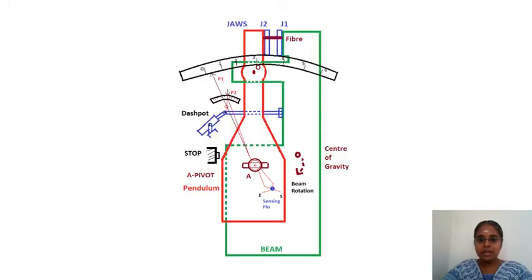There is a sensing pin here. The sensing pin stops when there is a difference between the movement of the beam and the pendulum. When the sample breaks, the sensing pin senses the change in the movement of the beam and the pendulum and stops the loading scale from moving. The beam and the pendulum continue moving even after the fiber bundle breaks, but the pointer stops moving.